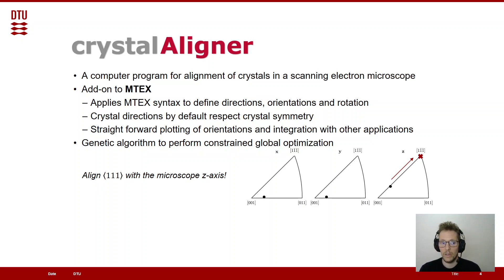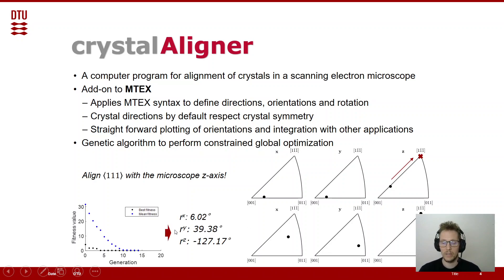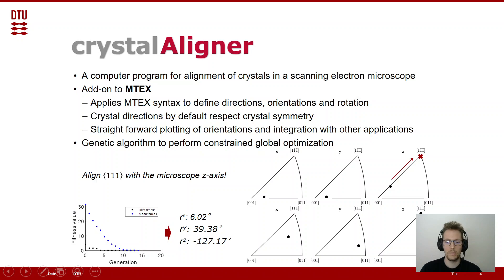To give you a very fast and simple example of what the toolbox does: we can tell the toolbox to align one of the 111 directions in a cubic crystal with the microscope z-axis. This is our initial orientation here shown in the z inverse pole figure, and we want this orientation to move towards the 111. We let it optimize the rotation, and you can see the fit value getting lower and lower — the error is decreasing. The optimization algorithm then returns rotation instructions for how to rotate the different axes of your stage to achieve this ideal alignment.